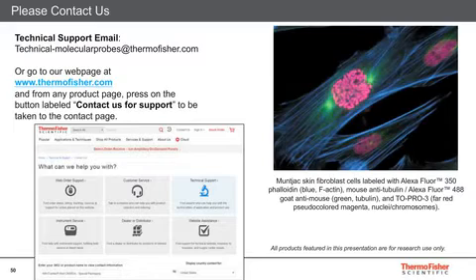And so that automated feature is great, and you can do Z-stacks with it, and you can do tiled or stitched images with it. There's a lot of great aspects, and we'll do demos in lab even. So if you're interested in the EVOS systems, you can check out the web page, or we can also help arrange to put you in touch with a representative who might do a demo with you.